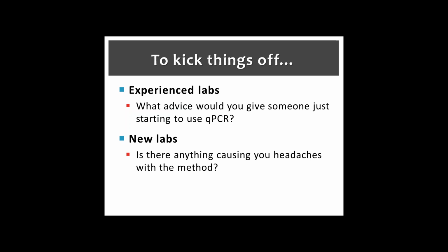I guess I'm just used to working with an SOP. Do this first, do this next, put this amount in. I work in analytical and microbiological, mostly analytical, so I'm just so used to reading and it telling me exactly what to do, step by step. Not flip to chapter 4 and then make this. Okay, a very good point. We will review and revise and make sure that we're getting that up and easy to access. We can also send that out through the MyQPCR listserv if folks think that will be helpful. I see nodding heads, yes.